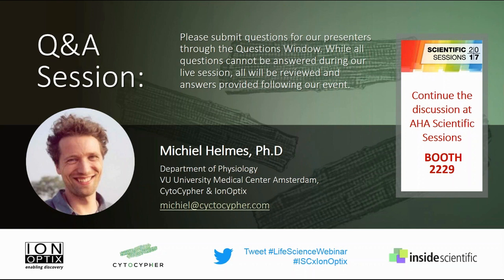Yes. Okay, very good. We're fully planning to adapt the protocol to neonatals and stem cells, but it's not a first priority. Our first priority is the area where it's needed hardest, and that is the adult isolated myocytes. Okay. Next question, Stephen Marston has asked, is it possible to make successive measurements on the same set of cells after adding different doses or drugs, for instance, an agonist?